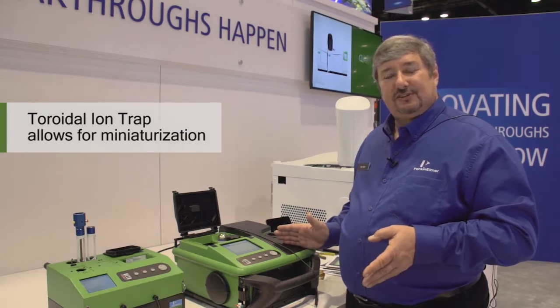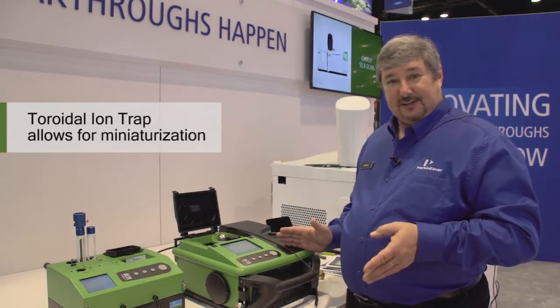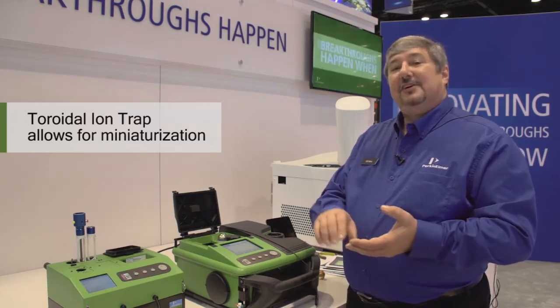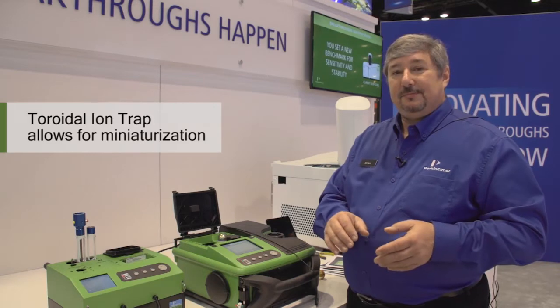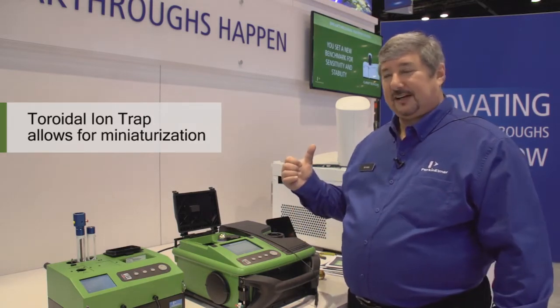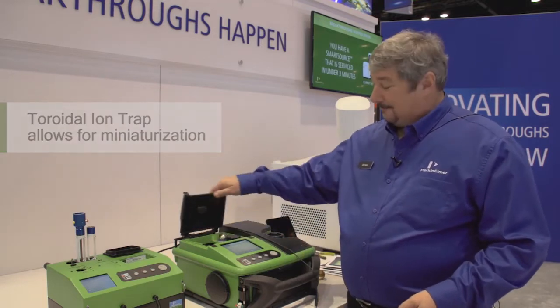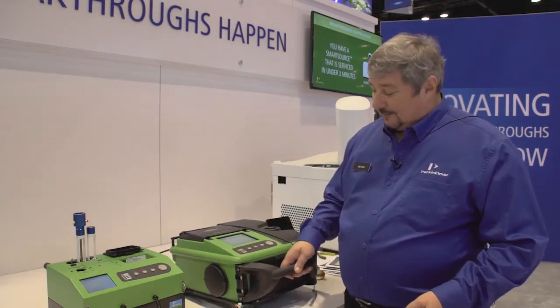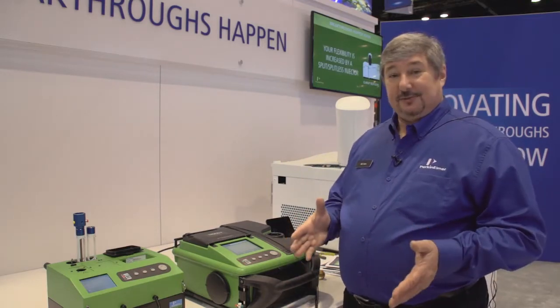One of the things you want to accomplish with a field portable instrument is using less power. So we've decided to use a toroidal ion trap as the mass spectrometer in this. As a result of that design, we don't have to use as much vacuum power as we would with our benchtop GC mass spec. That being the case, I can use a smaller battery. This unit weighs 32 pounds — I can carry it out into the field and do my analysis.